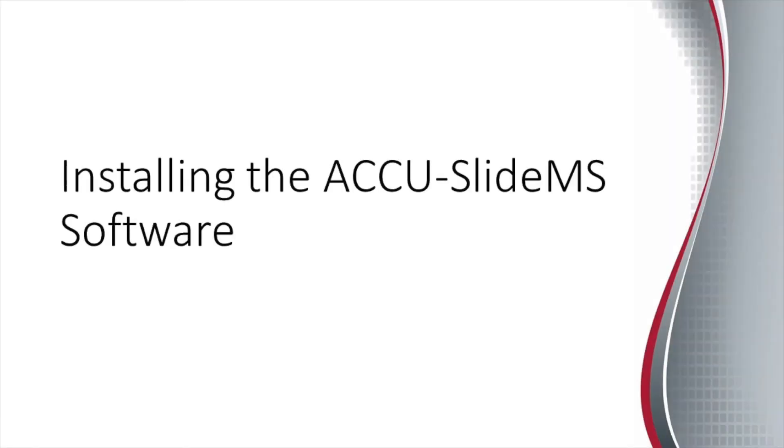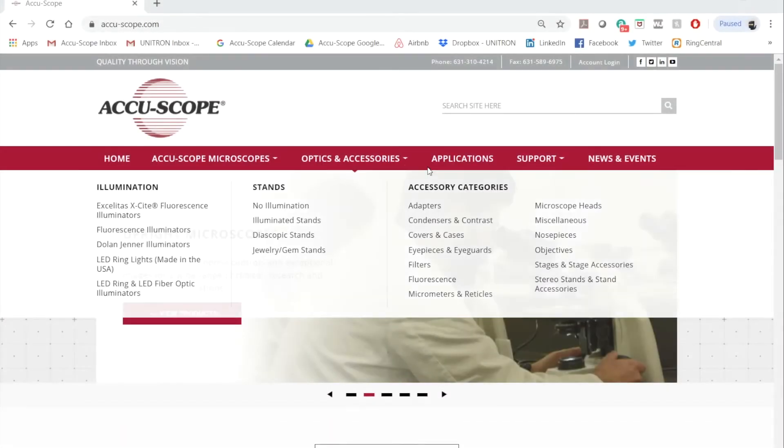Installing the AccuSlide MS software. The first step is to download the AccuSlide MS software setup file. As with the Basler Pylon camera software, you can find a download link on the AccuScope website.